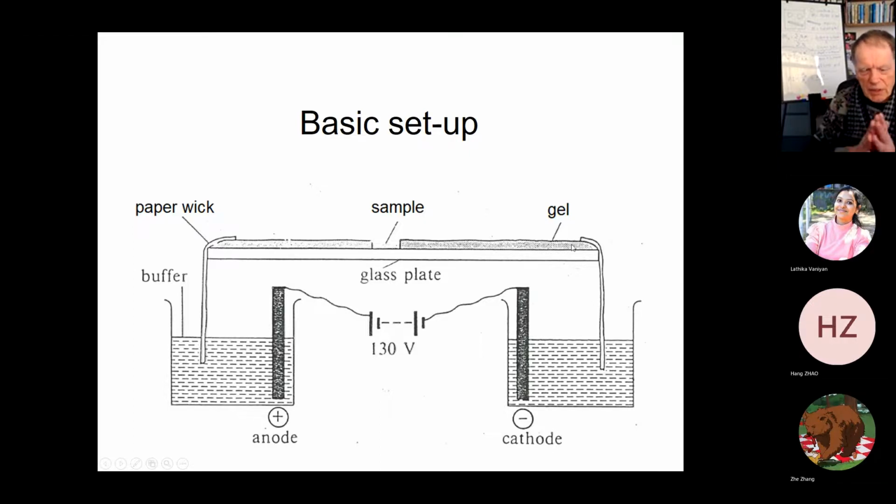But if we want to use this sort of setup to measure the molecular weights of proteins, we've got some problems, because how fast the protein moves on the gel depends not only on the molecular weight. The larger the molecular weight, the slower the molecules will move because they will be hindered by the gel particles. But the rate of electrophoretic movement will depend on the charge.